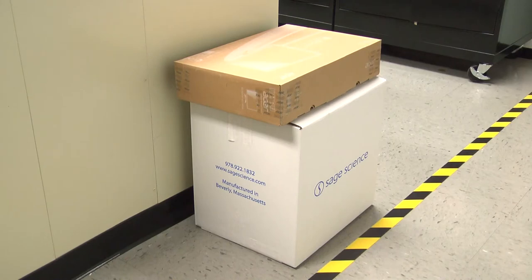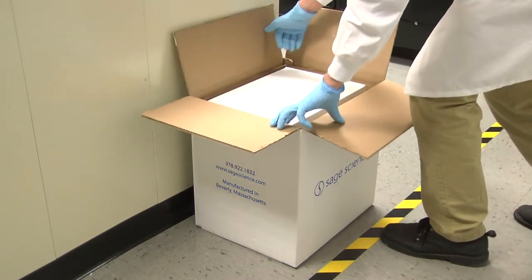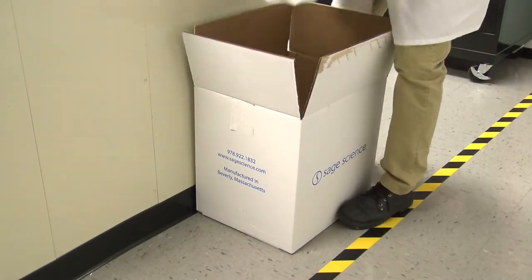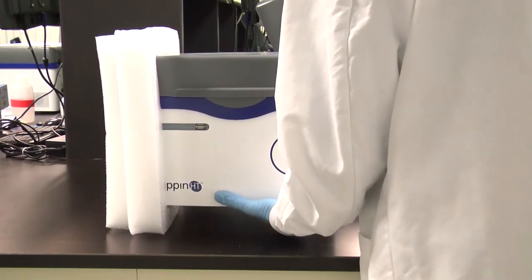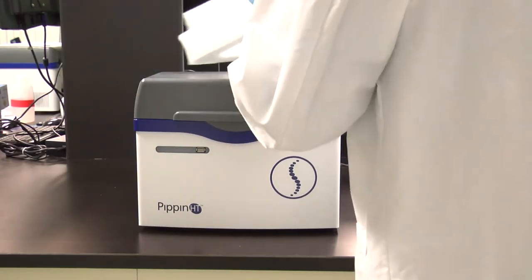Installation. The Pippin HT instrumentation is shipped in two boxes. One will contain the Pippin HT and accessories. The second box will contain the computer monitor in the manufacturer's original packaging. Open the Pippin HT box and remove the accessory pack. Reach into the box and grab the Pippin HT at the bottom of the instrument. It weighs about 20 pounds. Pull it from the box along with the foam inserts and place it on your lab bench. Remove the inserts.